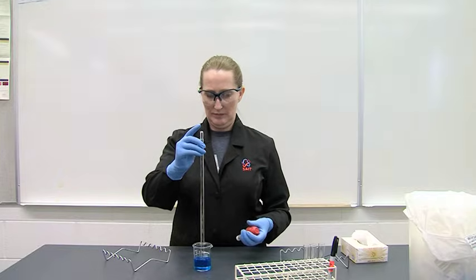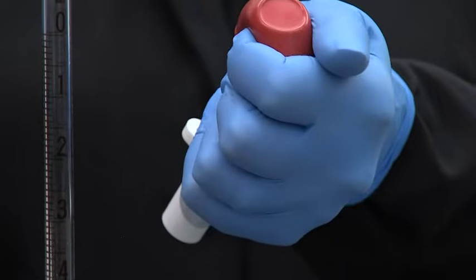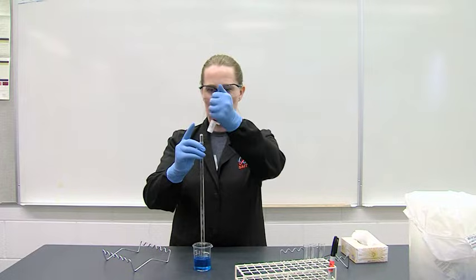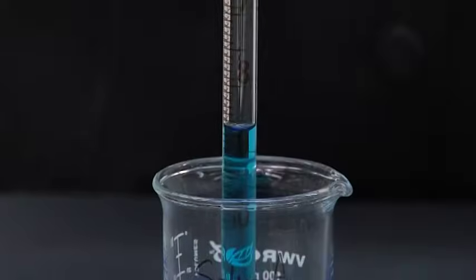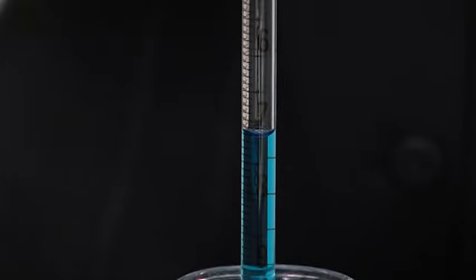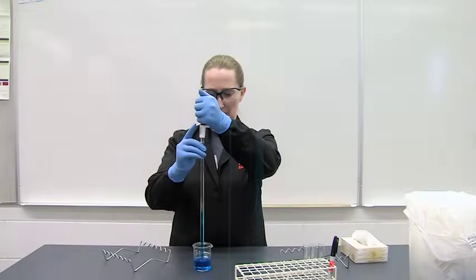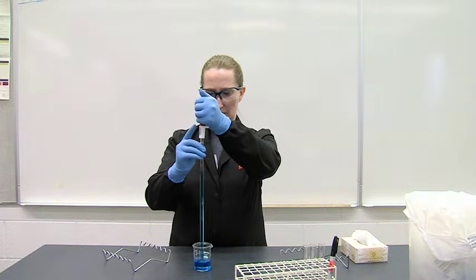Expel air from the pipette bulb and place the bulb firmly on the top of the pipette stem. Slowly release pressure on the bulb to draw liquid up the pipette past the calibration mark by about 1 cm. Maintain steady pressure to prevent fluid from contaminating the bulb.